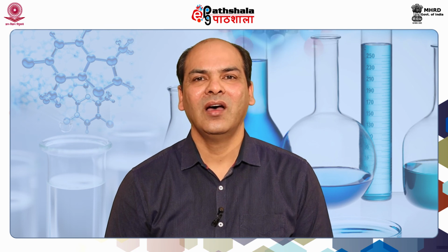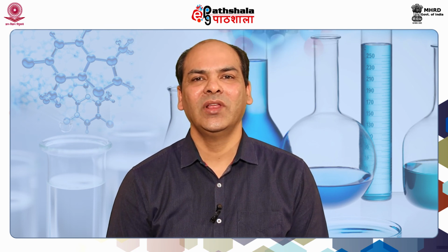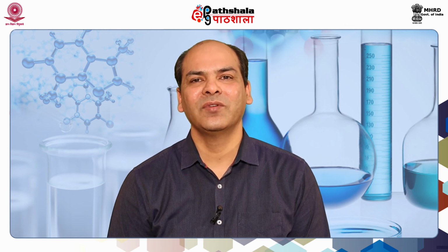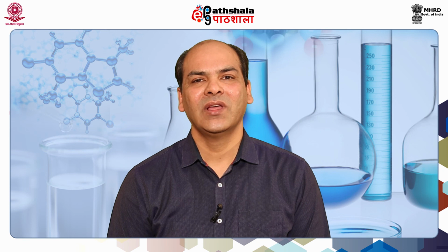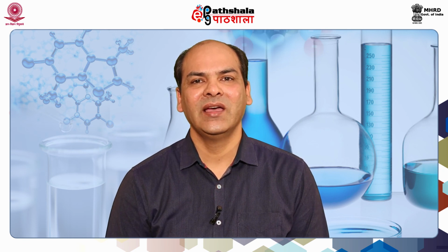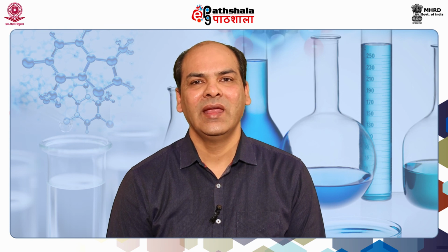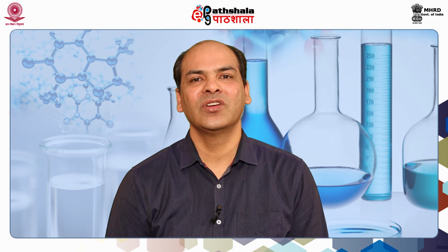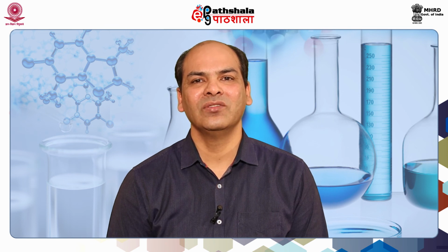We also learned how to produce linearly polarized light and circularly polarized light, how they differ from each other, and what the major differences between the two are. That was the idea for this lecture, and when to use these two types of light to determine the structures of biomolecules.